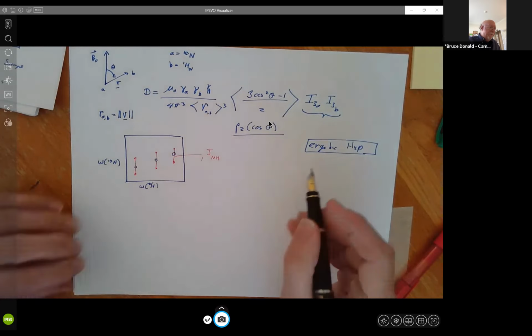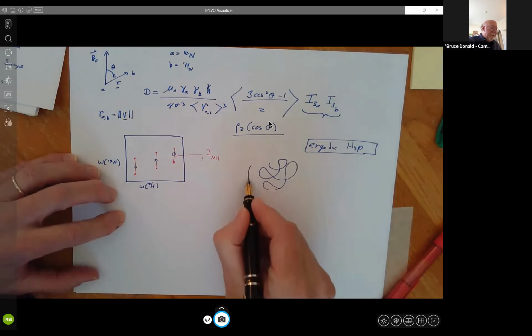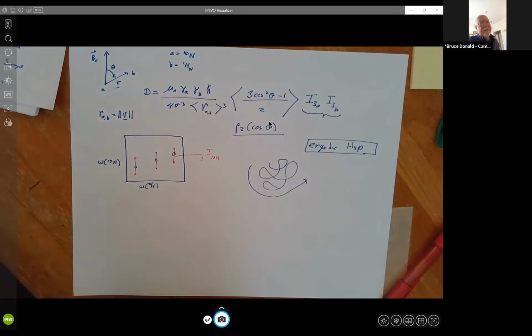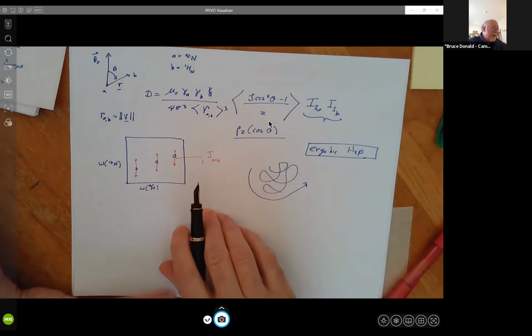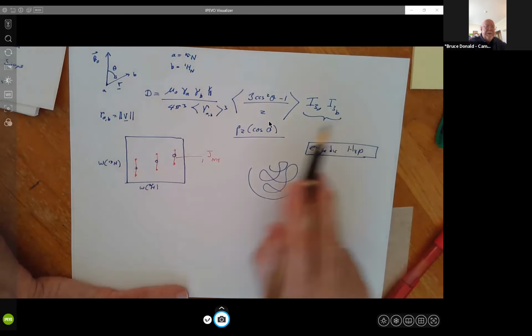However, if we look at a protein in solution, right, this thing is tumbling rapidly. The average reorientation time for a small protein is about 10 nanoseconds, for a bigger one, maybe 20, 30 nanoseconds. So these things are spinning and tumbling rapidly and isotropically. And all that matters is orientation, and that's averaging out. So in a solution NMR experiment where everything is nicely averaged, these couplings actually average out to zero.